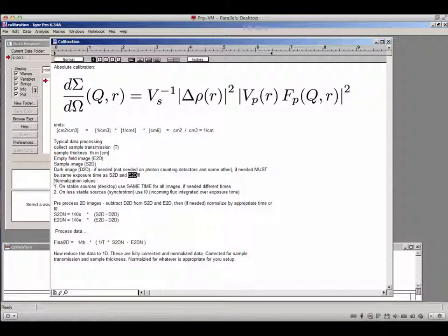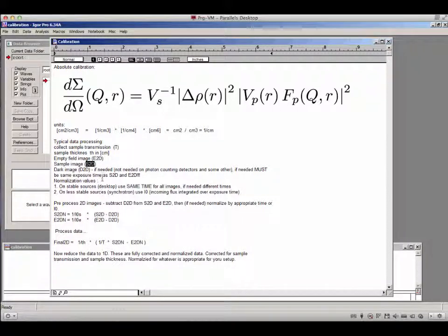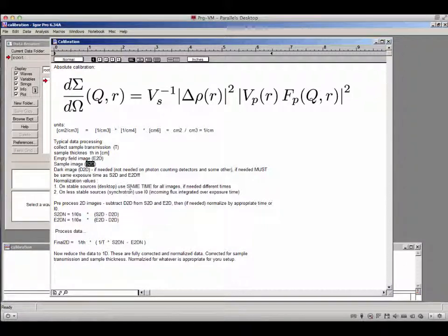What we do next is we have a choice of doing normalization. I would suggest collecting empty and sample images for the same times or same flux. If that cannot be done, you may have to normalize them together. On really stable sources, typically desktops, you may use the same time for all images. If you need different times, normalize by time. On less stable sources like a synchrotron, we use some kind of counting device, called I0, to normalize.